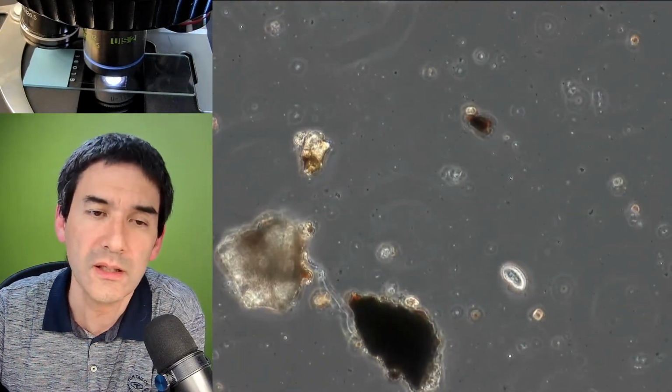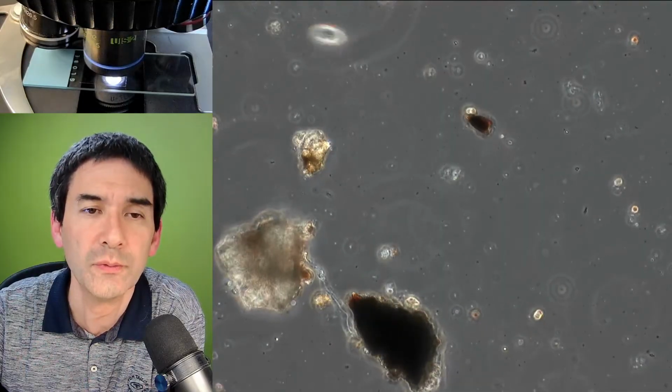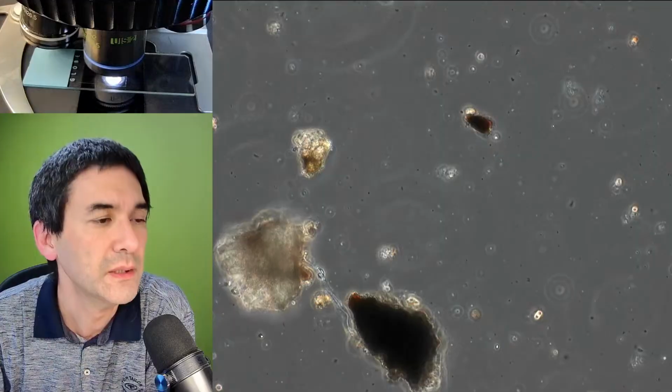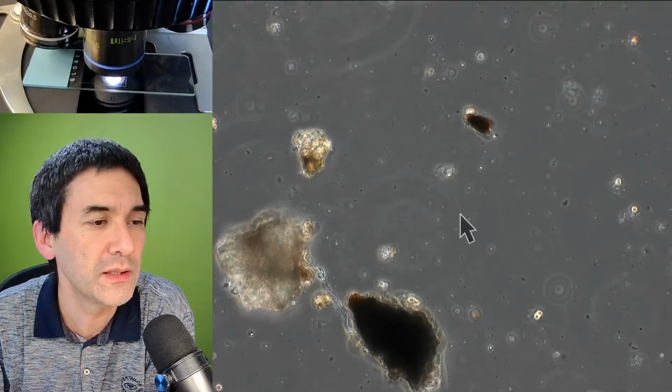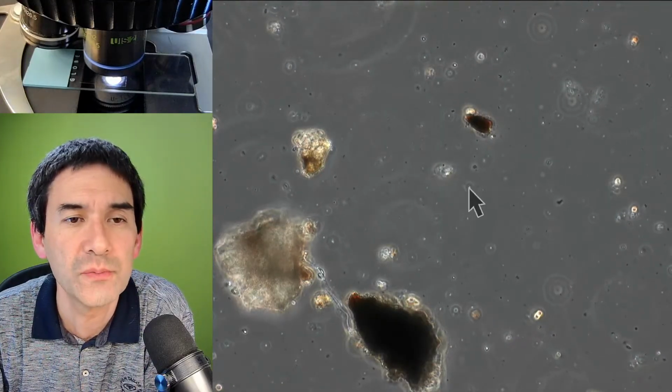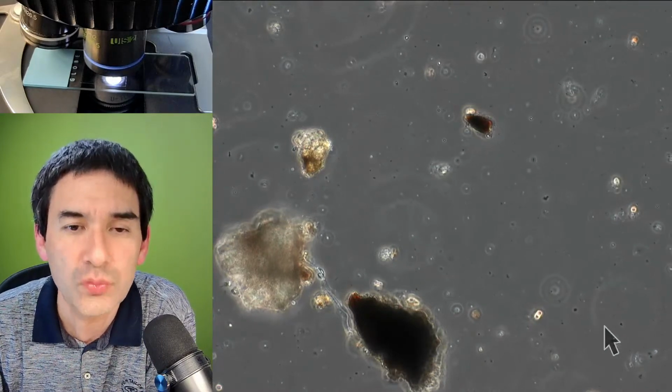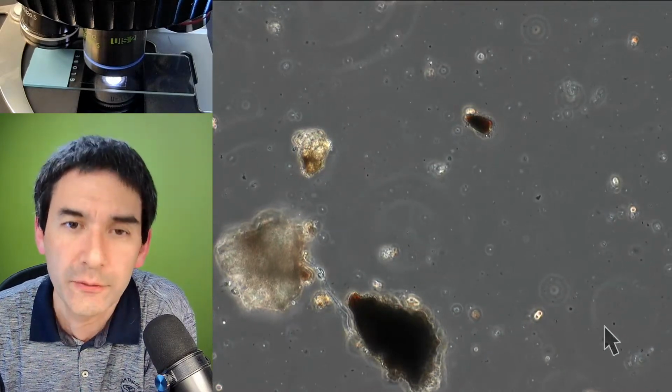Okay, well, at least a little bit of movement going on. But in phase contrast, what we're now able to see in the background here, and that is actually the thing that I wanted to make clear, is that many of those tiny dots that you see in the background are bacteria, and they can be extremely difficult to actually see under bright field.